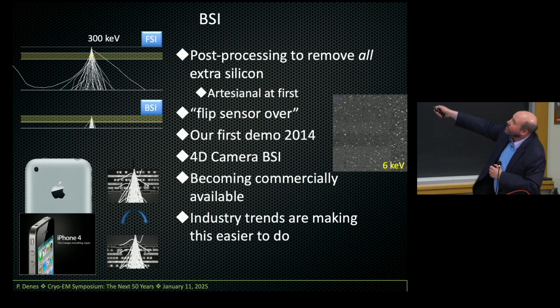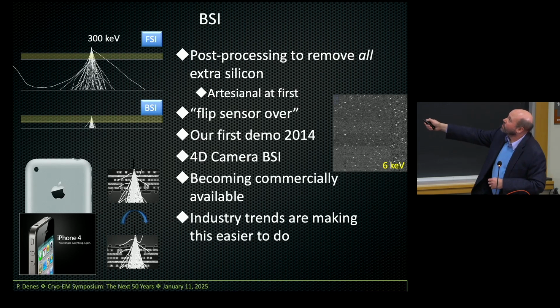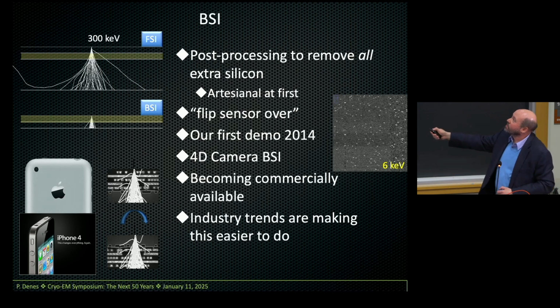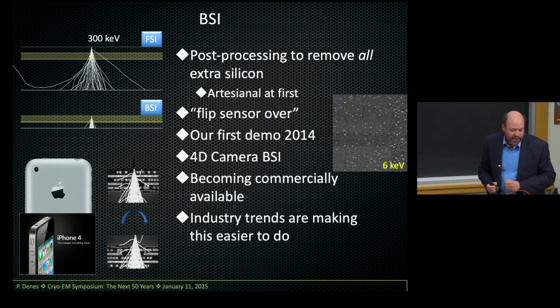And that's one where instead of going through the wiring end of a sensor into the active region with some more material, you shave all of this off, turn it upside down, go directly into the sensitive volume, and that means at high energies, you get rid of some of this initial scattering, but this becomes more important as the energy goes down, because the lower the energy is, the more scattering there is in this dead material, up to the point that you may absorb all the energy and not even see a lower energy electron.